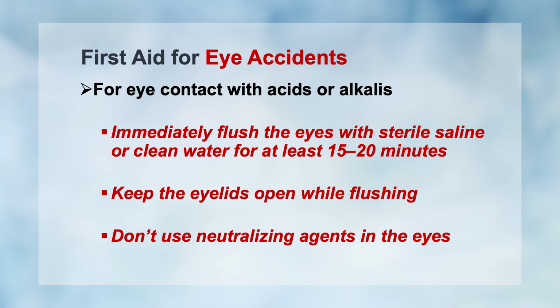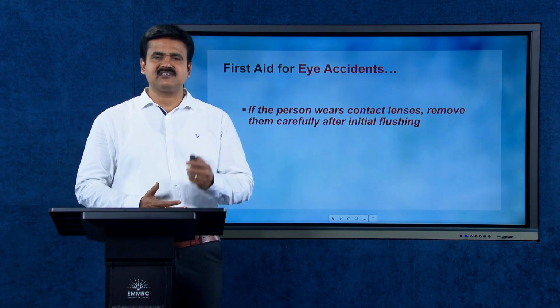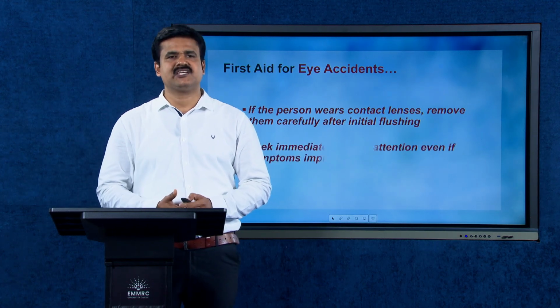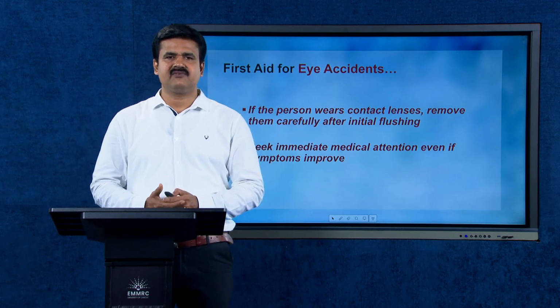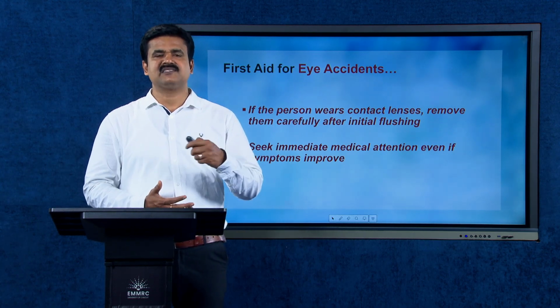Don't use neutralizing agents or chemicals in the eyes. If the person wears contact lenses, remove them carefully after initial flushing. Seek immediate medical attention even if symptoms improve.